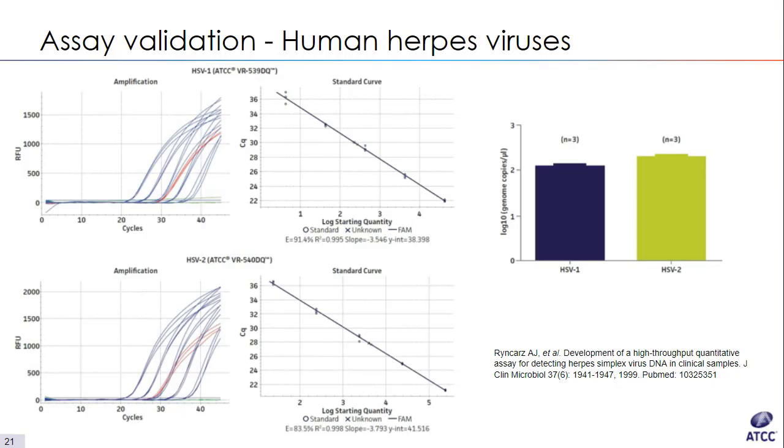These qPCRs were used to quantify the genome copies in the samples within a very narrow interval near 10 to the 2 genome copies per microliter. We ran this assay several times to confirm results. Consistency at this step is paramount because these experiments won't be yours alone. Your end users will be running them as well as part of the performance qualification in their lab.